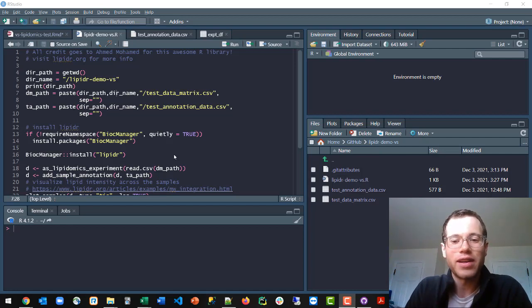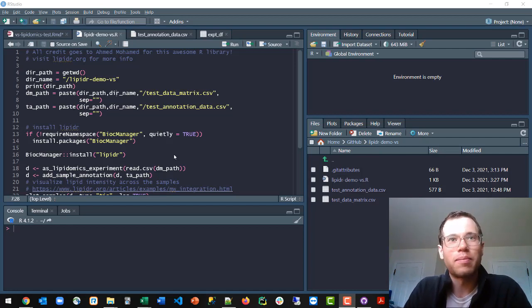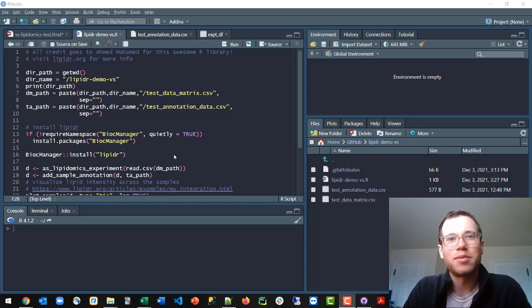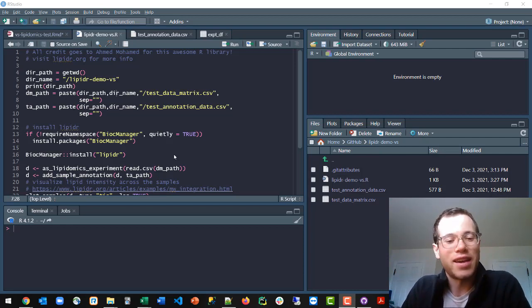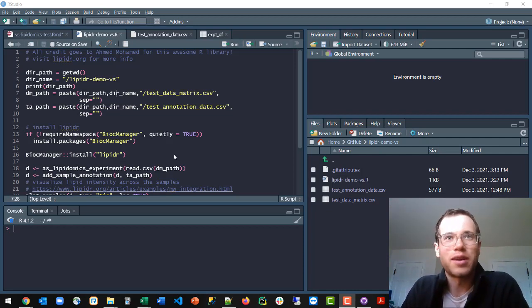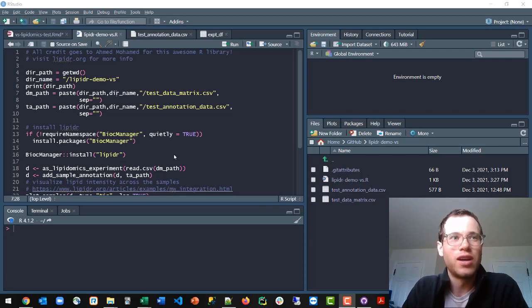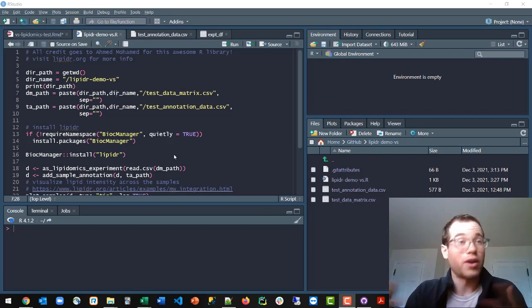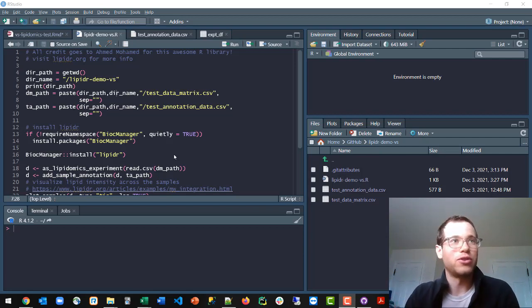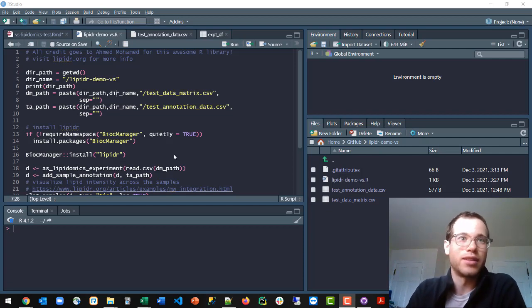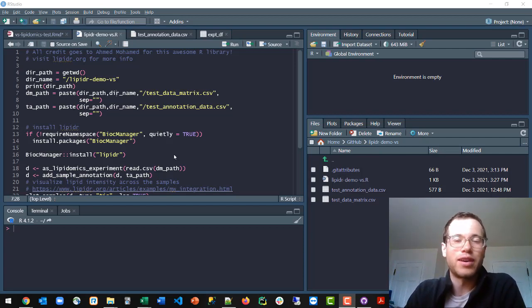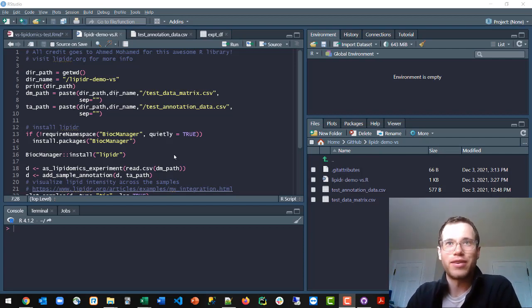There is a very cool package or library that has been created by a person named Ahmed Mohamed. They've done a fantastic job creating documentation and a website to walk through the way in which you can use this tool to look at lipidomics datasets. To briefly talk about the background of lipidomics, there's been a very cool explosion of data available to people in recent years because of the ability to use mass spectrometry to determine or quantify the concentrations of lipids that are present in living systems.